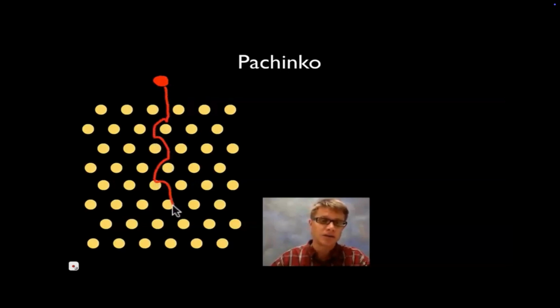Now we have to figure out how to separate the DNA according to its length. And so to do that, let me talk about pachinko machines. Pachinko machines are essentially these vertical machines. They're really popular in Japan. You put a ball up at the top. You usually flick the ball up at the top. And then that ball is going to bounce down. And if it eventually goes into a little cup down here at the bottom, then you might get more of those balls back.